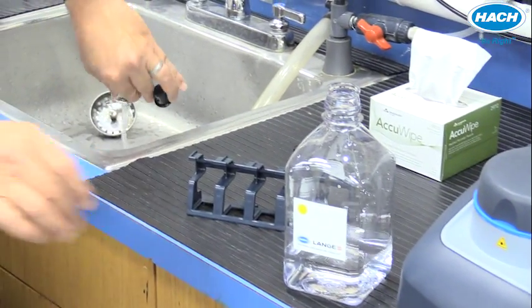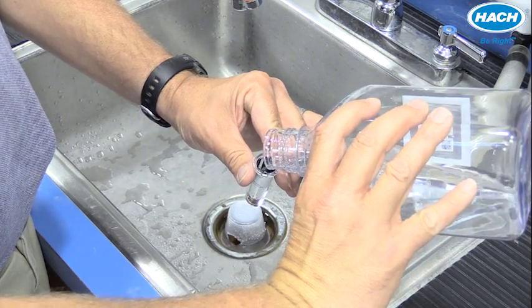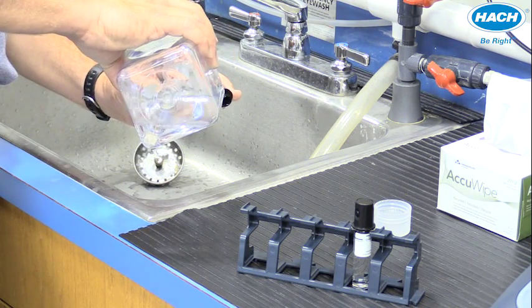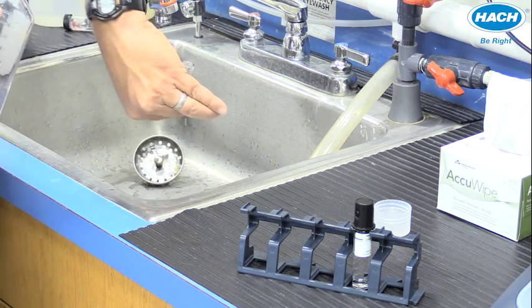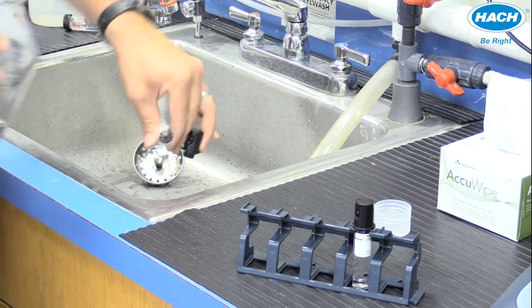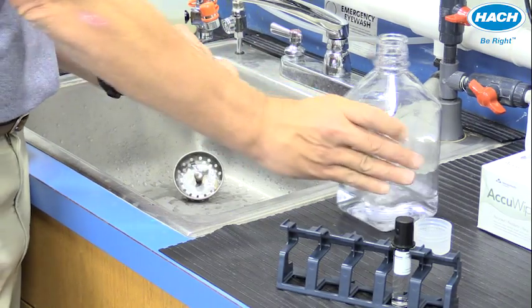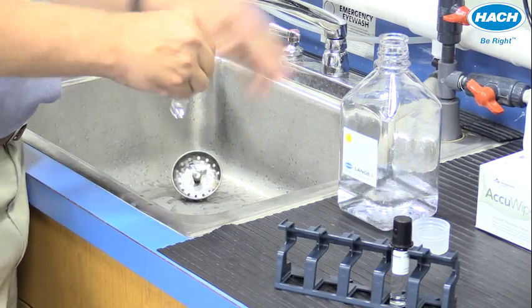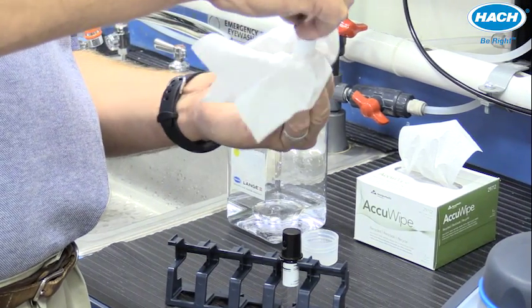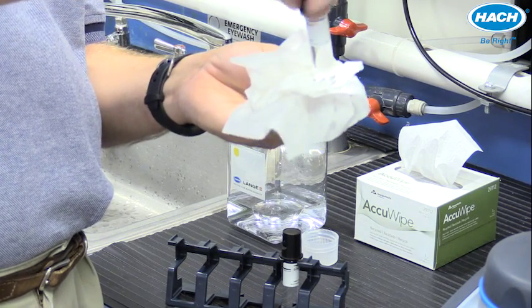We'll then rinse a sample vial and the cap three times with the sample to be measured, and finally fill up the sample vial to the fill mark with the sample. Using a tissue, we'll wipe away any excess water, making sure the sides of the vial, in addition to the bottom of the vial, are nice and clean.